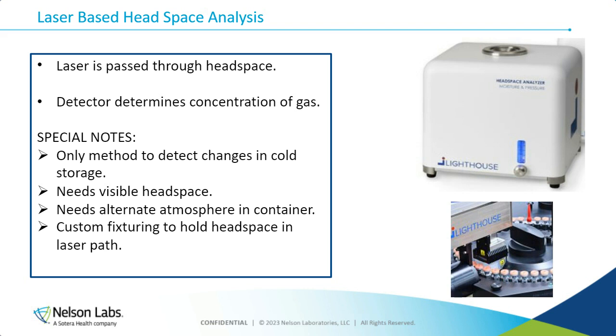I take my sample, the top box here, that's just a bench unit, and I would insert my vial into that little hole at the top. I need to have fixturing so that the laser's going through the headspace, it can't go through the liquid. It's just going to run through there, and then I'd be measuring oxygen concentration based on the detector interpreting that signal and determining what oxygen concentration that correlated to.